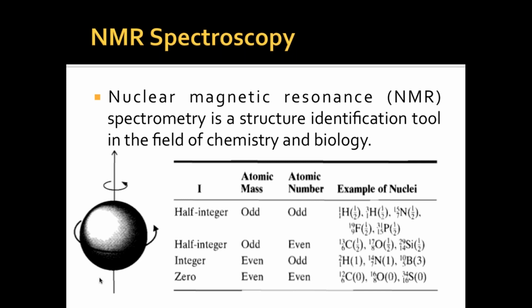Now, what is an NMR signal? Why am I saying NMR signal? NMR signal means which nucleus will be in resonance with the magnetic field. That's easy to follow, right?